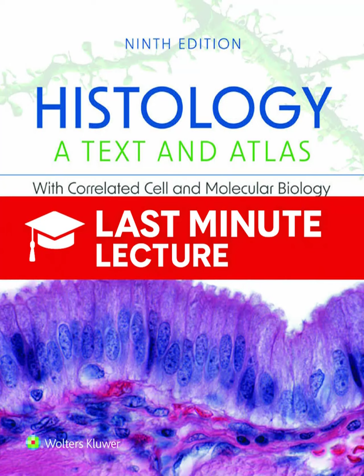And in biology, that's mainly what? It's dominated by two main chemical groups, the phosphate groups in nucleic acids, so DNA and RNA, and the sulfate groups you find in complex carbohydrates like glycosaminoglycans. So things like cartilage? Right, cartilage or the granules in mast cells. This reaction is called basophilia, or base-loving.